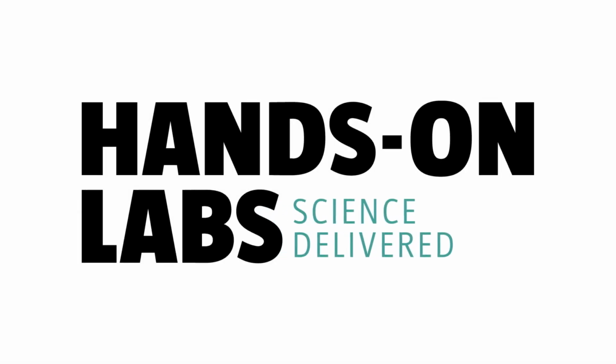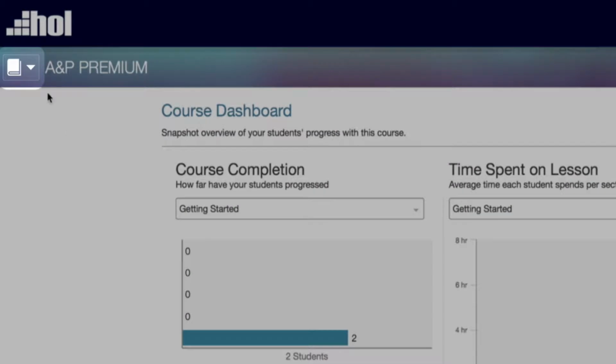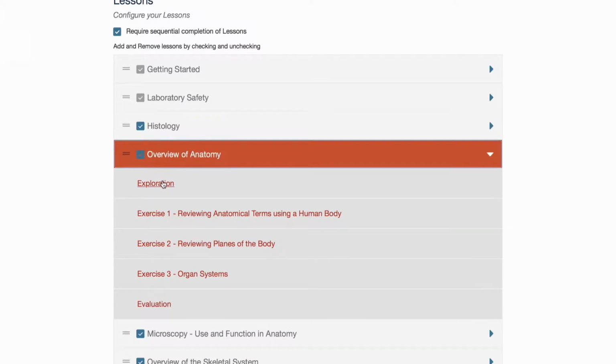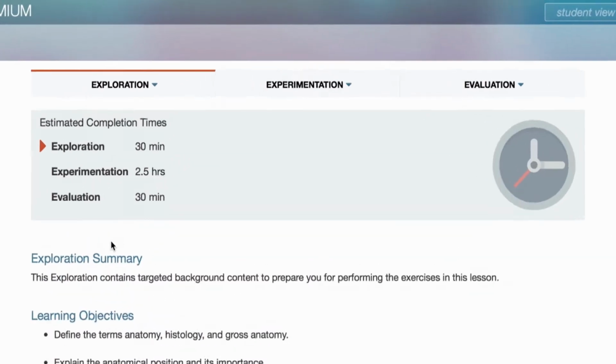This video will guide you through a lesson on HOLcloud. The lessons can be accessed through the notebook navigation icon. Click on the lesson to expand it and click on Exploration. Our lessons are made up of 3 sections.